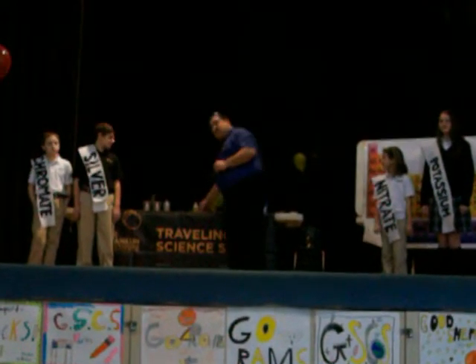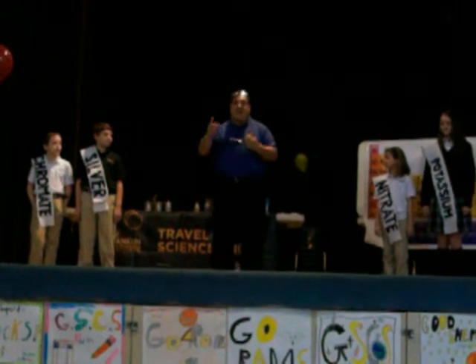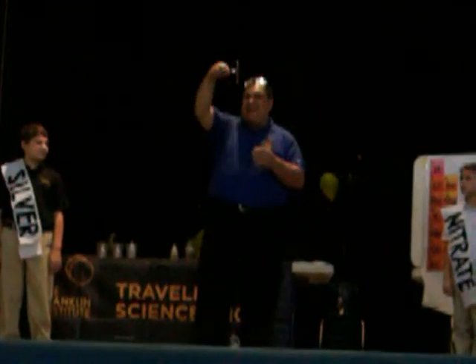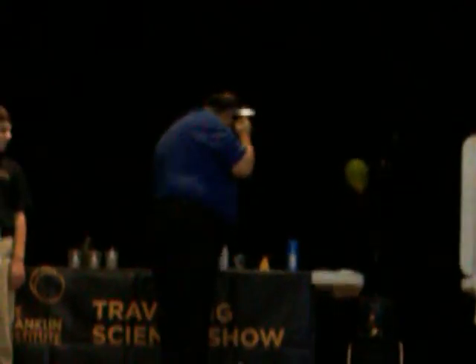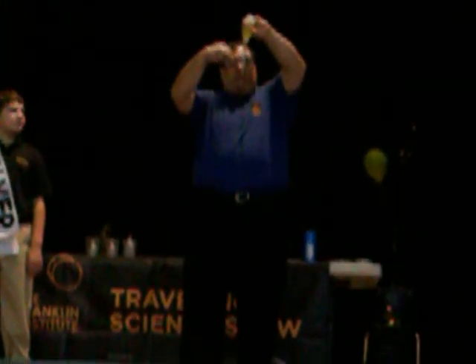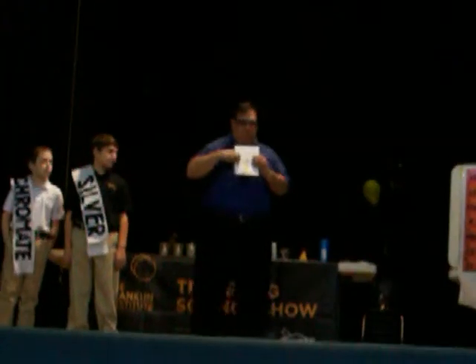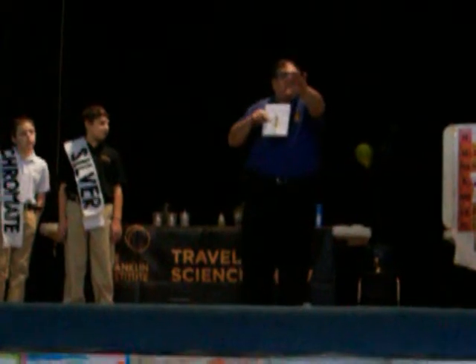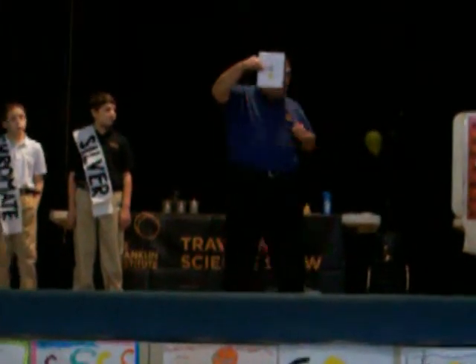Watch this, because this is the actual chemical reaction that you just saw with our volunteers. It wouldn't be a chemistry show if I didn't have a test tube, right? So let's start by adding potassium chromate, a yellow liquid, to my test tube. Just like that. And to help you guys to see it, I'm going to hold a white background. Can you see that yellow color there? Okay? I know some of you who are closer will be able to see it a little bit better, but that's all right. You'll be able to see everything in just a second.